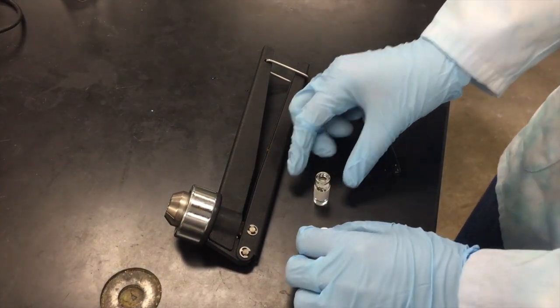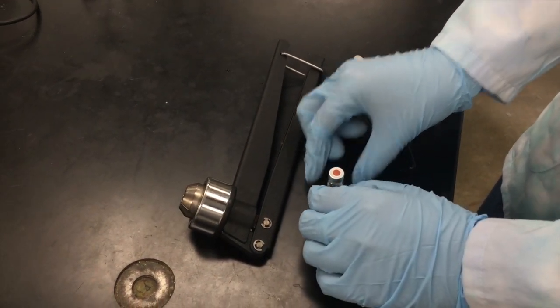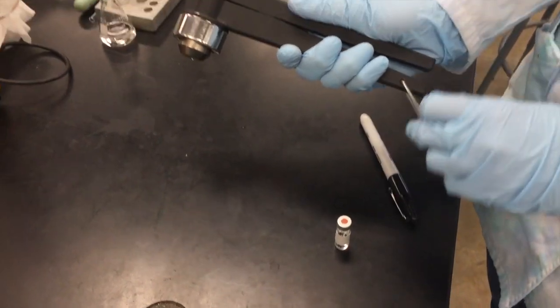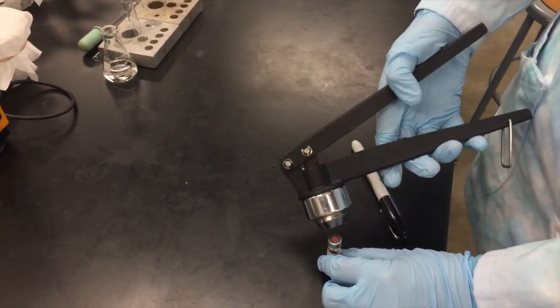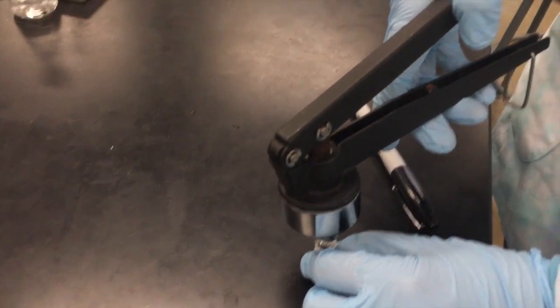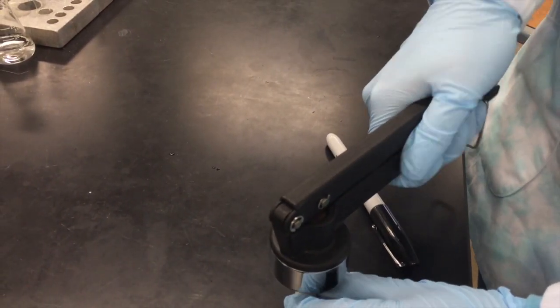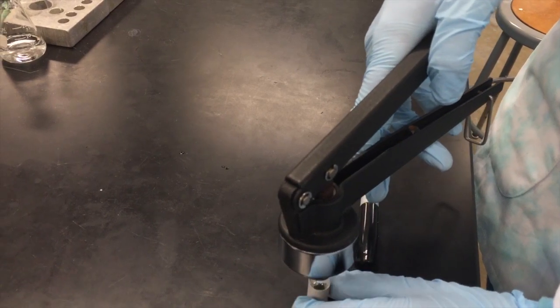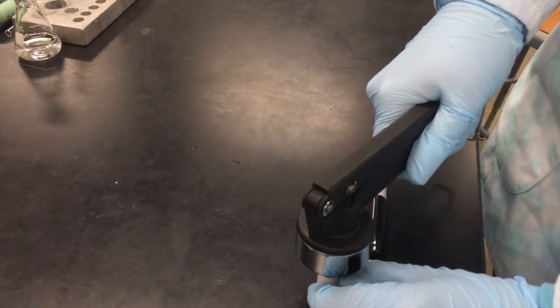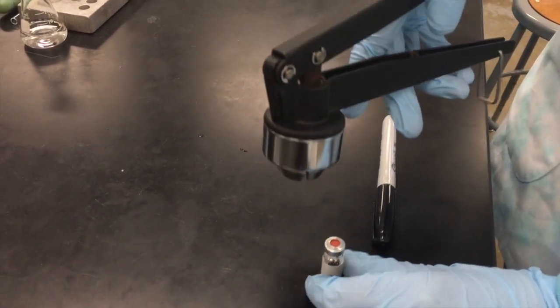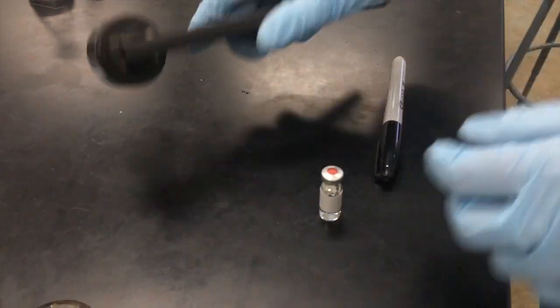Place the cap onto the vial and tighten the cap by crimping it. Turn the vial one quarter turn and crimp again. Be sure the cap is securely fastened.